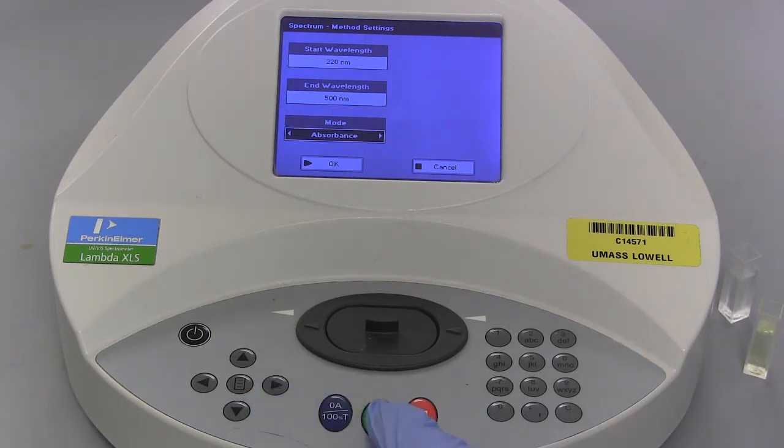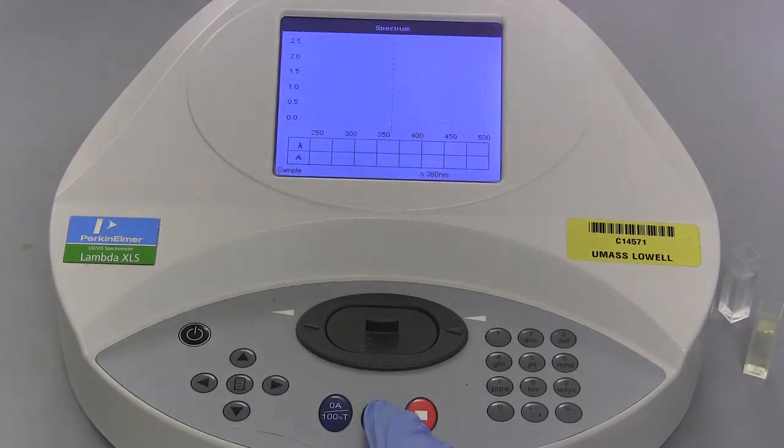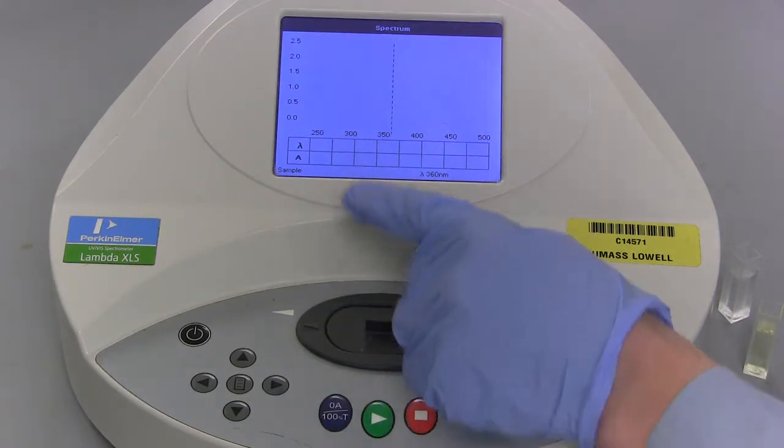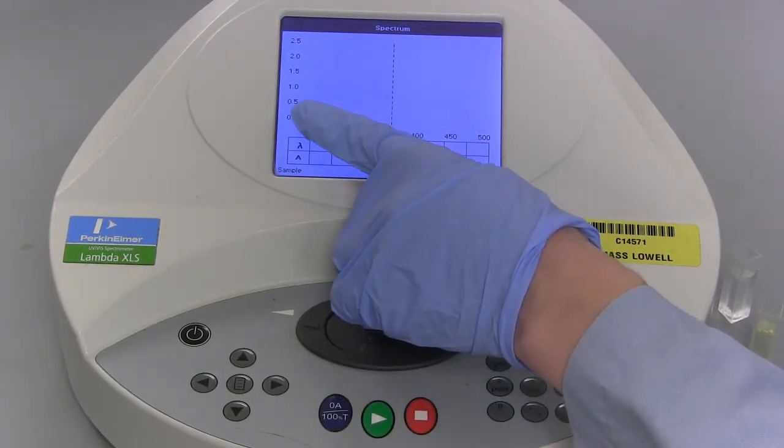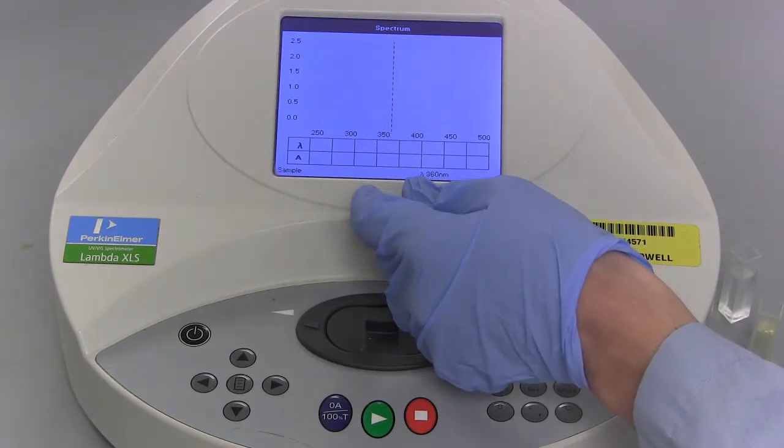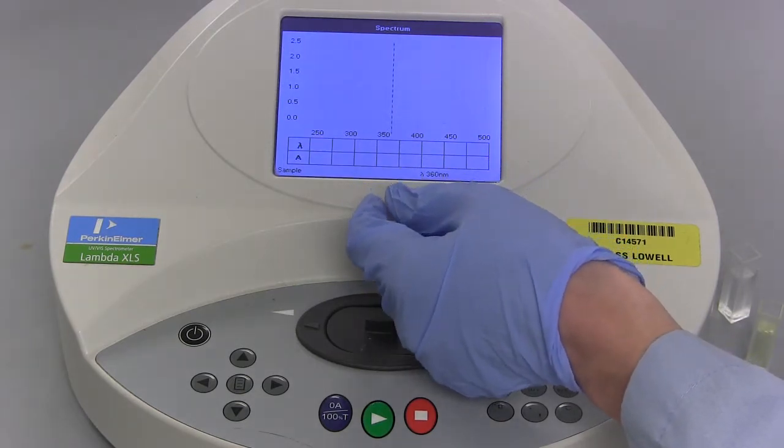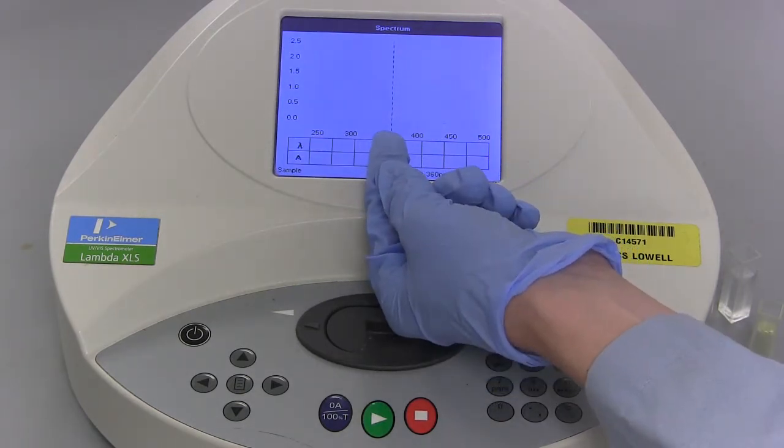Select the green OK button to display the table and graph for the spectrum data. The y-axis corresponds to the absorbance of excitation and how frequently the excitation occurs at each peak, and the x-axis displays the wavelength of energy absorbed.